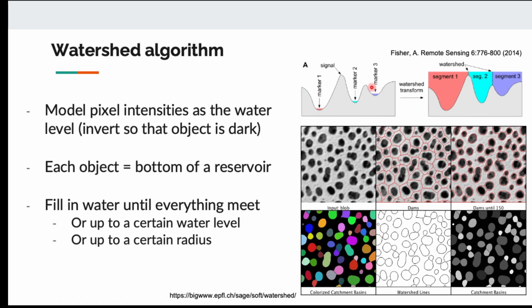When we pour color into it, you can see this kind of pattern. The red color will fill in this part of the geography. The cyan color will fill in this part of the geography, and the blue color will fill this part of the geography. So you can turn this back into cell boundary. The region that the red water can reach, this is the cell that we will call the red cell. The region that the cyan color can reach, we will call the cyan cell.